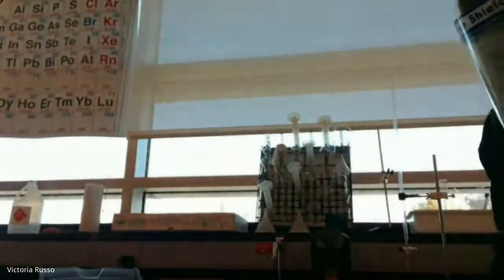All right, so I'm going to take the calorimeter off and put it to the side for a second. And here I have my magnesium metal. So I am going to put a cup on the scale. Let's just use a beaker. I'm just going to use a cup. And I'm going to zero it. And this is magnesium metal, ribbon metal. I'm going to cut it into smaller pieces.